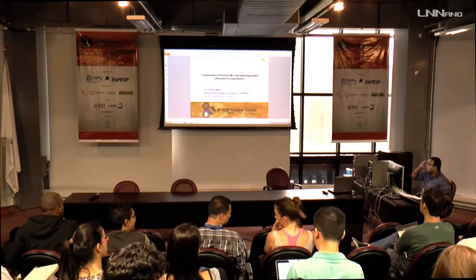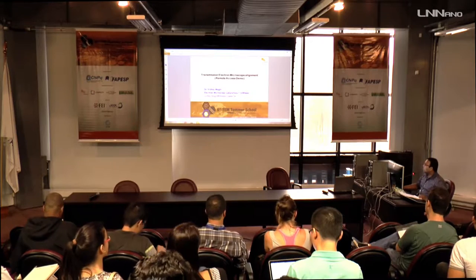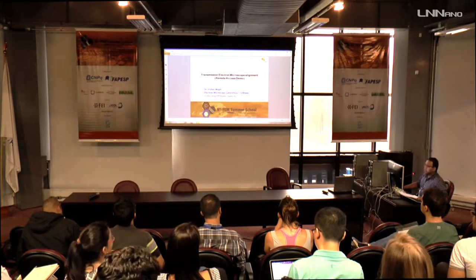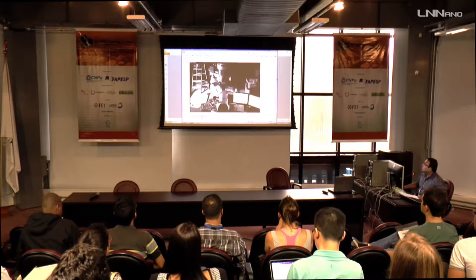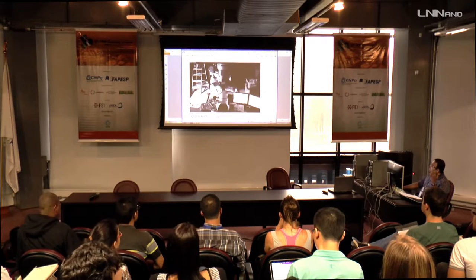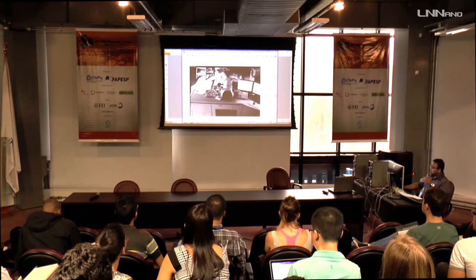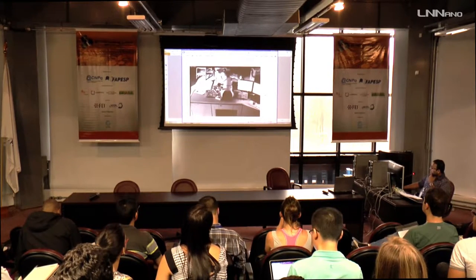To align the transmission electron microscope operating remotely, first I will try to show you the TEM, and then we can go ahead. I think most of the people visited the TEM lab yesterday, and this is the microscope. Using this access, we can operate this machine not only from here, but from anywhere in the world. So we have control access of it.